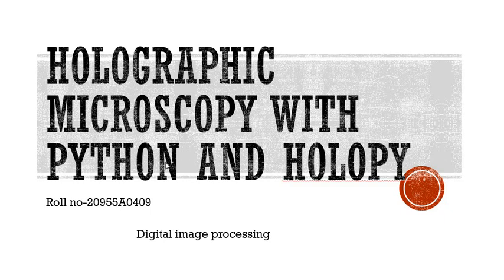HoloPy is a library written in Python to extract and develop images from holographic microscopy. Holographic microscopy is also used for detecting and recreating images in a holographic or 3D form.